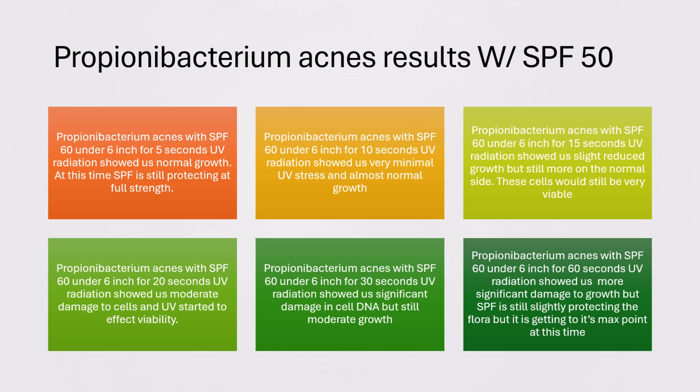This is actually one of the only experimental phases where we saw a difference between 5 seconds and 10 seconds. Then we bumped it up to 15 seconds of UV exposure, and this showed us a slightly reduced amount of growth, but still more on the normal side of growth. This bacteria is still growing very well under 15 seconds.